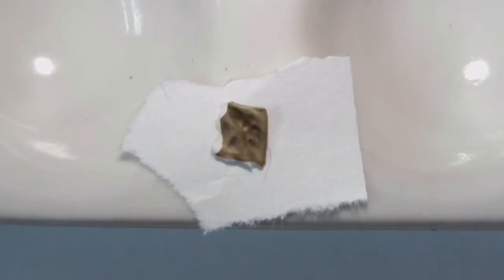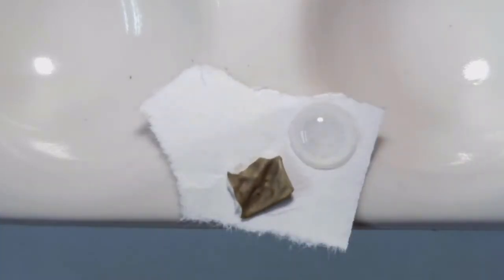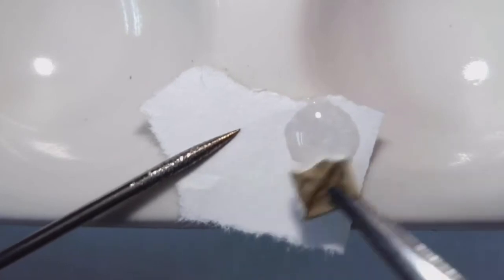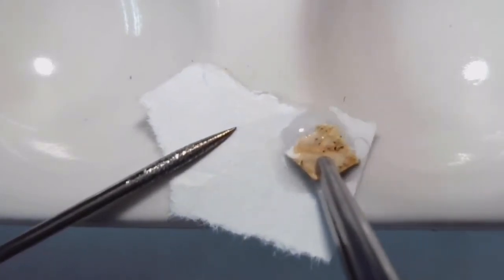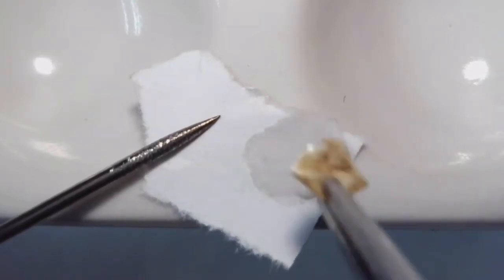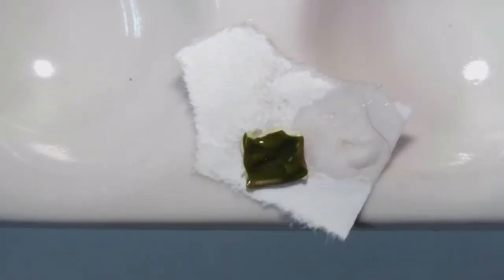And so let's just go ahead and do that. What you'll want to do is just take your dropper, put a little spot of K next to your specimen, and then with tweezers you can just dip your specimen into the K and make sure it gets nice and on there, and then set it aside. And now just wait a little bit as it's taken up.